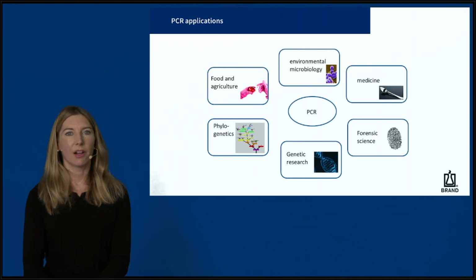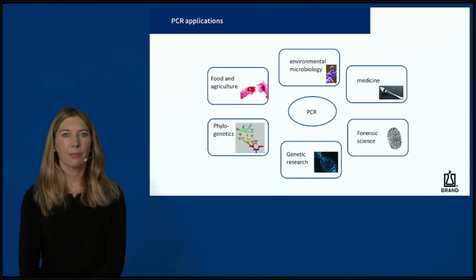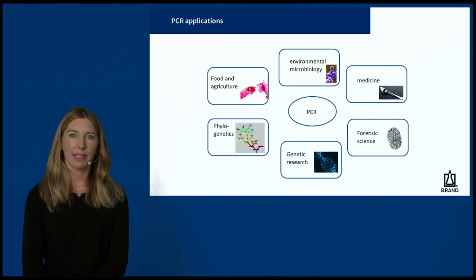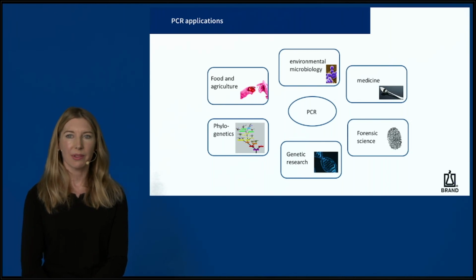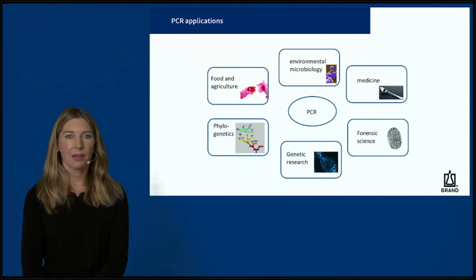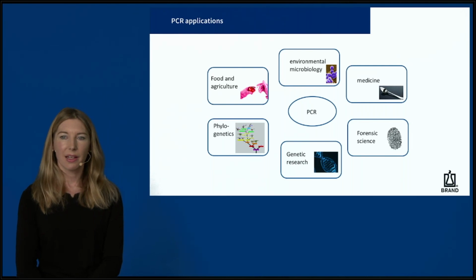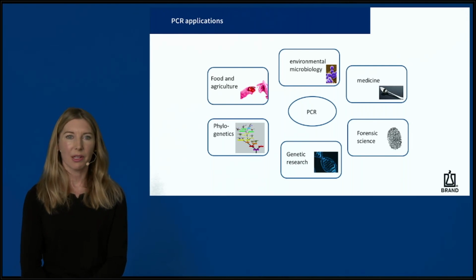What is PCR and what are possible applications? PCR has become one of the most valuable techniques currently used in bioscience, diagnostics, or forensic science. This in vitro technique targets and amplifies specific regions of a DNA strand and makes millions of copies of the target piece of DNA.